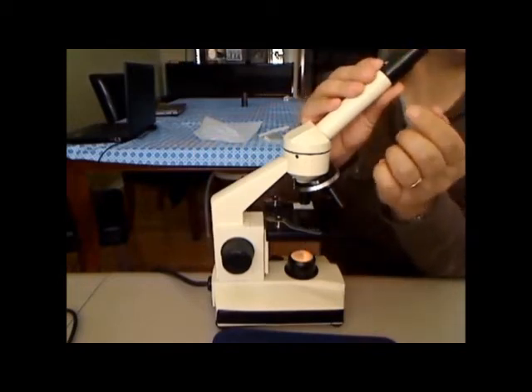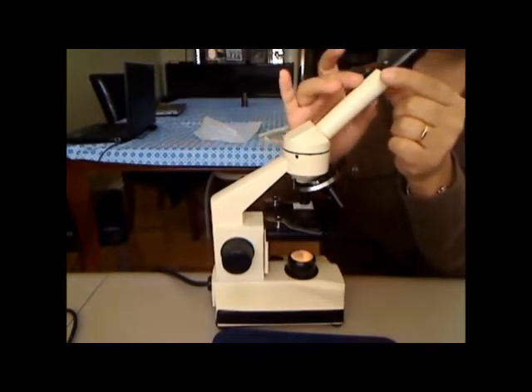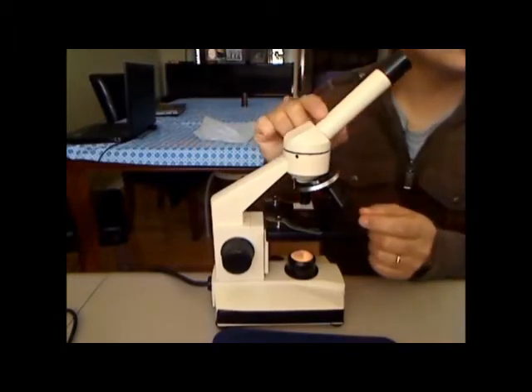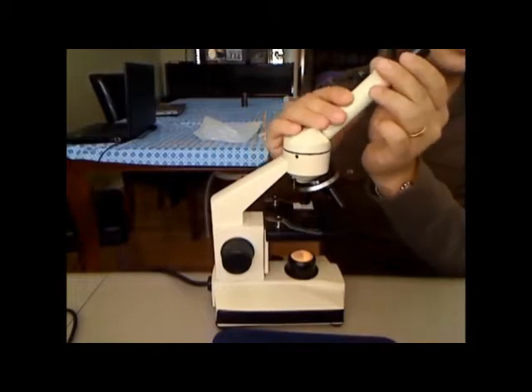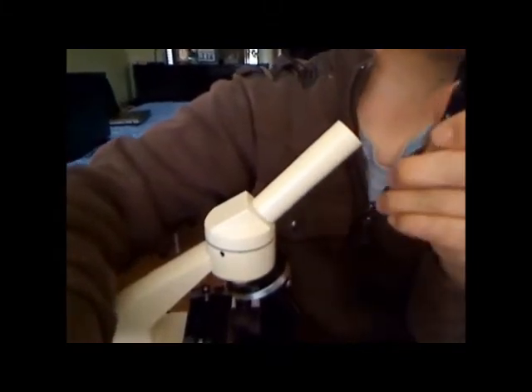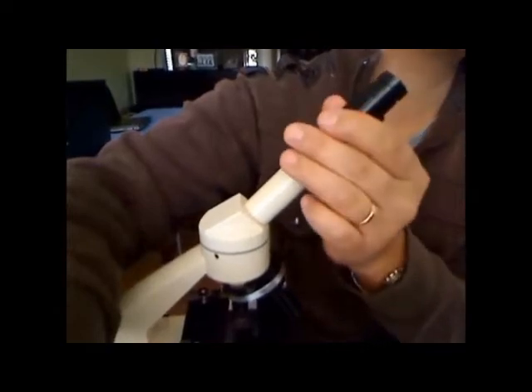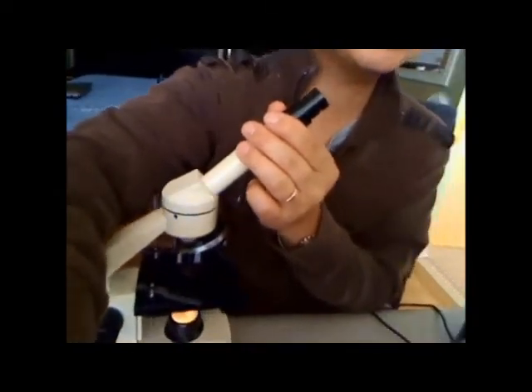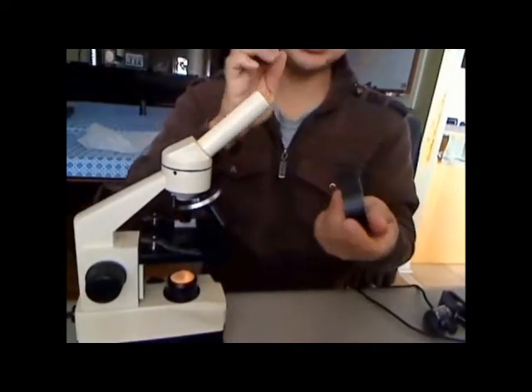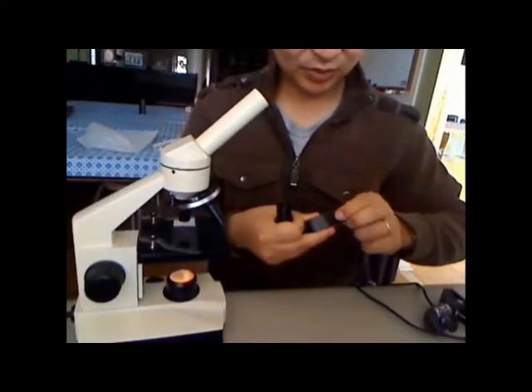We're going to tape the ocular lens upside-down to the microscope tube. So instead of it fitting snugly into the tube normally, we're going to flip it over to the other side. It won't change the magnification by any means. Then we're going to tape it with black tape. The good thing is it's temporary, so you can remove it without ruining your microscope at all.